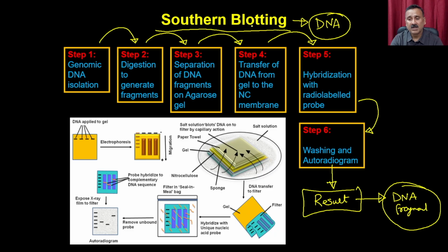And the second piece of information you can also extract is the copy number, that is, how many fragments or how many different genes of that particular fragment are present in that particular genome. So, it is going to tell you the location of that DNA fragment, and it is also going to tell you the information about the copy number, right. So far we have not discussed the copy number, but I think we are going to discuss it when we get to molecular cloning and other kinds of events.